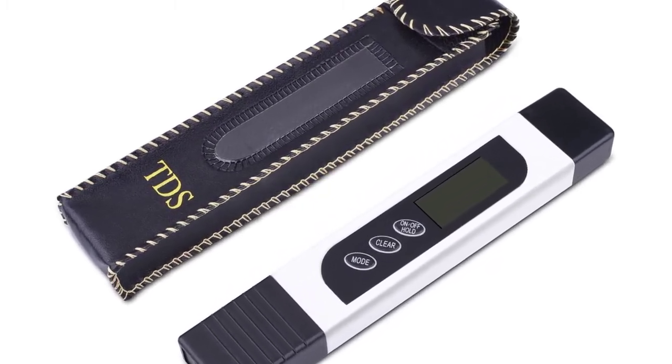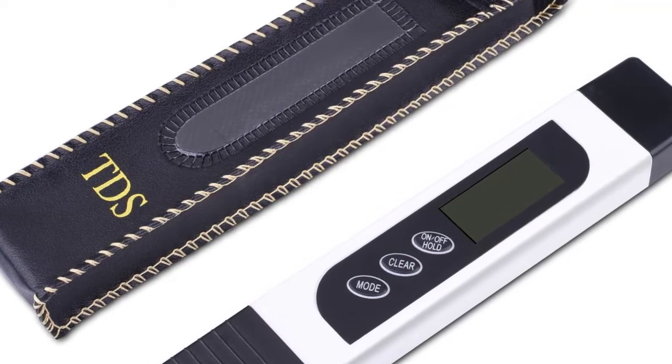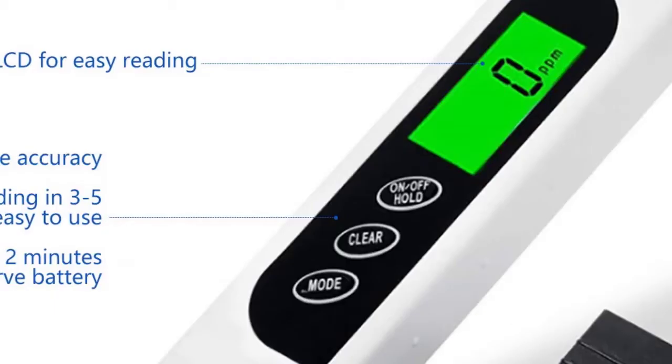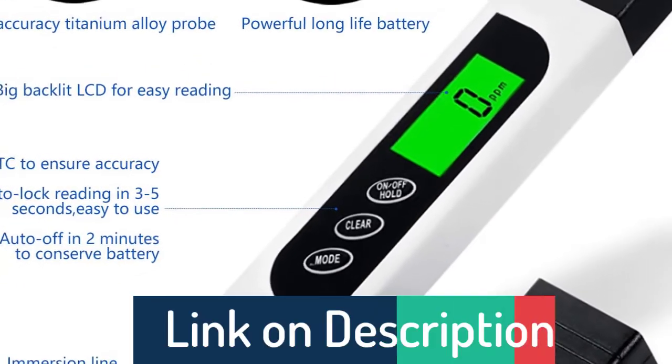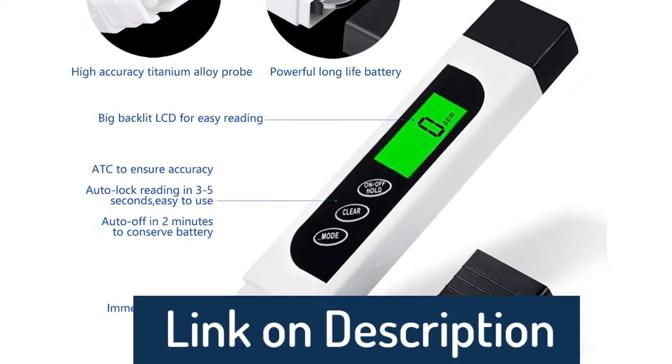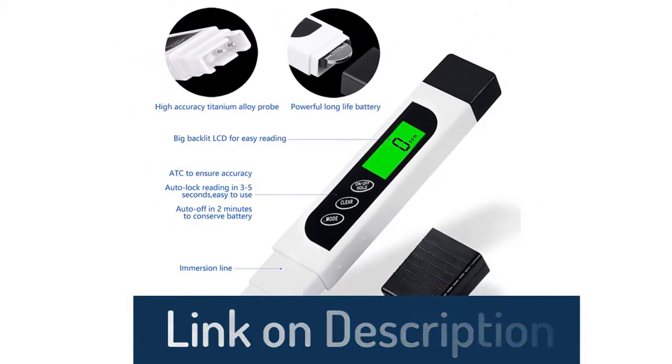It saves measurements for convenient reading and recording. Battery life is approximately 1,000 hours of usage, powered by 2x1.5V button cell batteries, included. The meter shuts off automatically after 10 minutes of non-use to conserve batteries. There is also a large display and easy-to-read LCD screen.